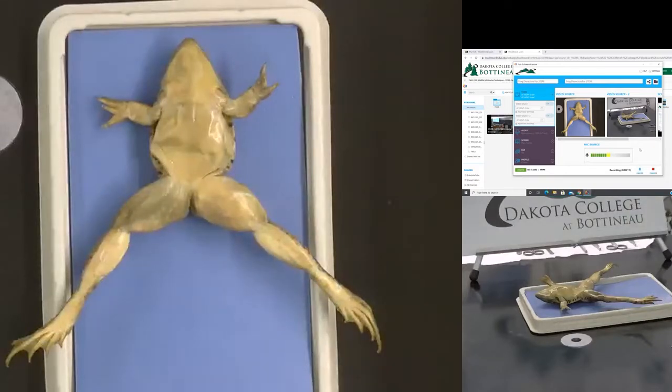This is the Fish and Wildlife Department, and today we are going to do a frog dissection. So what class of animals do frogs belong to? Amphibians. Very good. So what's unique about amphibians? They go through metamorphosis, like different stages of the life cycle, like tadpole to... Very good.